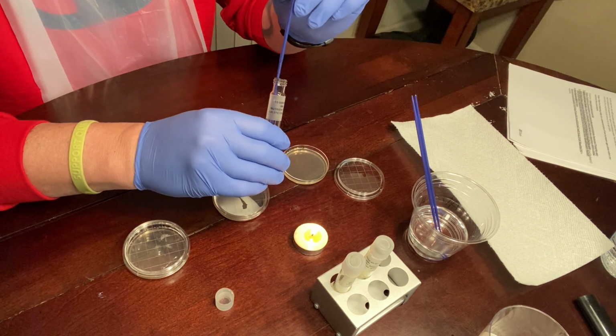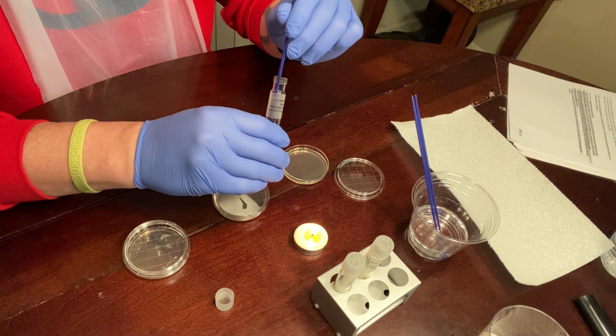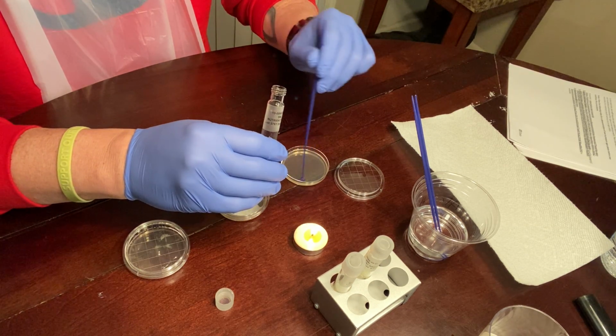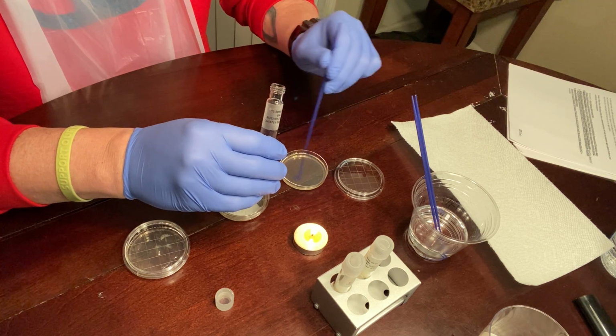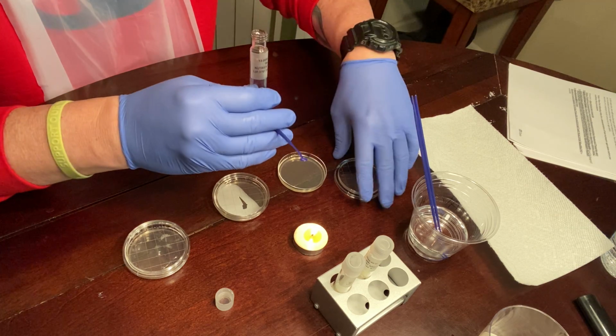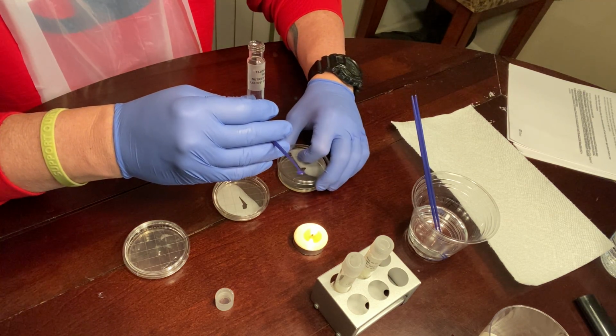Careful not to touch the lip. I just transfer. A zigzag motion here to 4 separate quadrants. I'm going to cover this dish up.